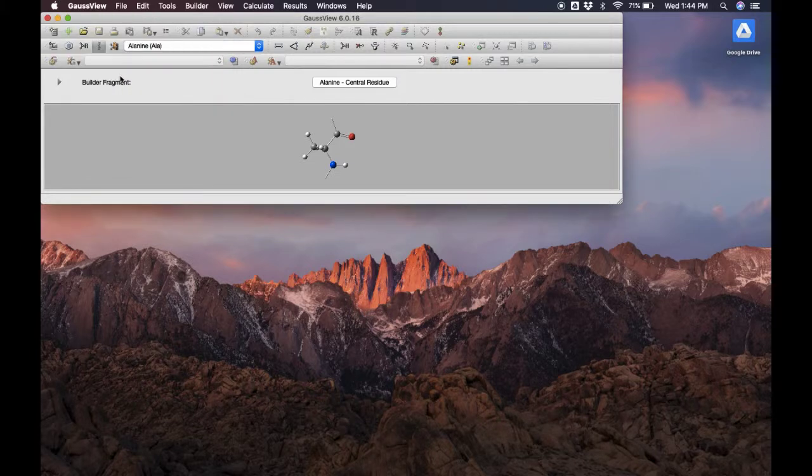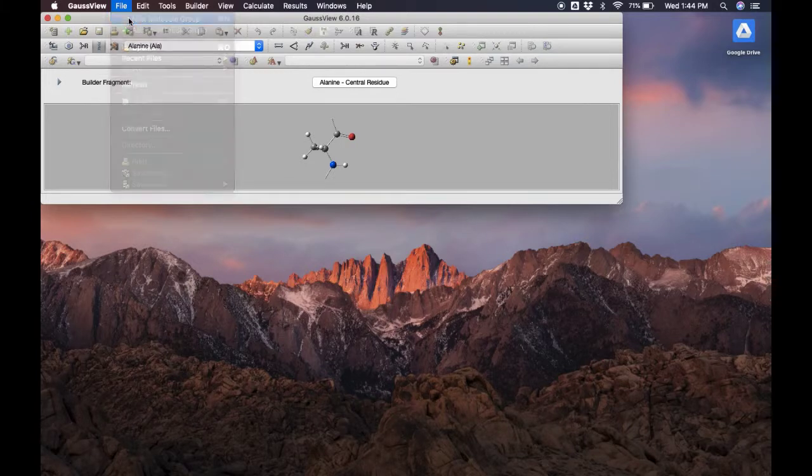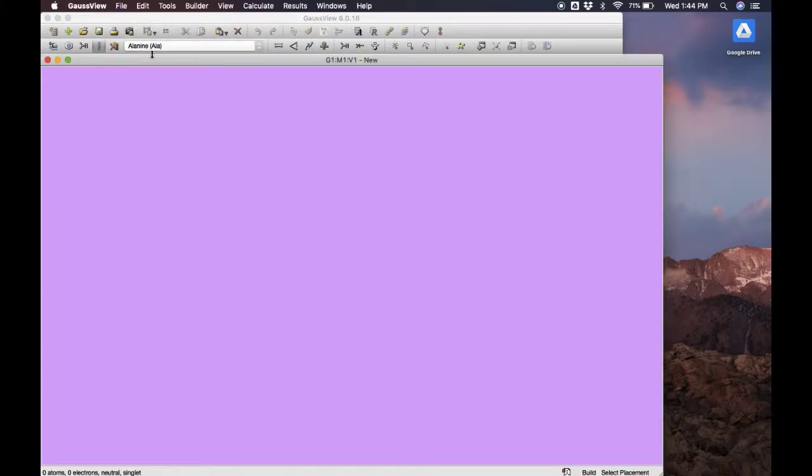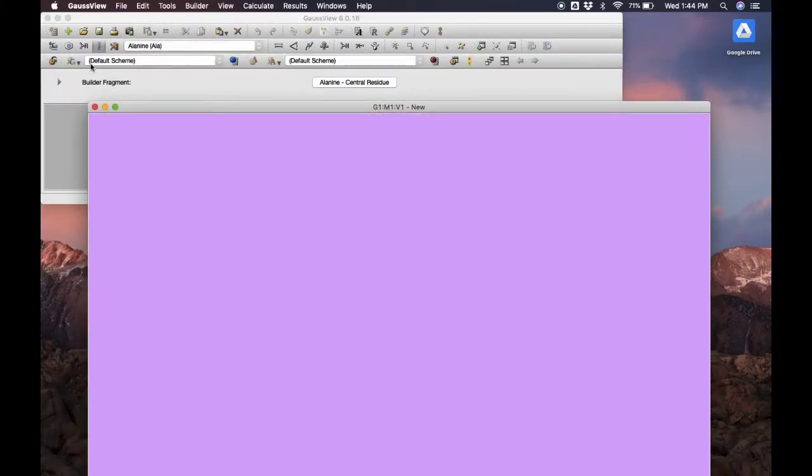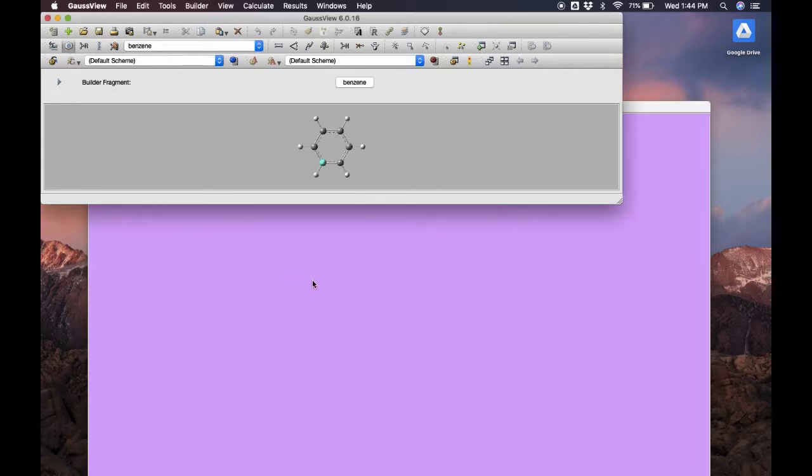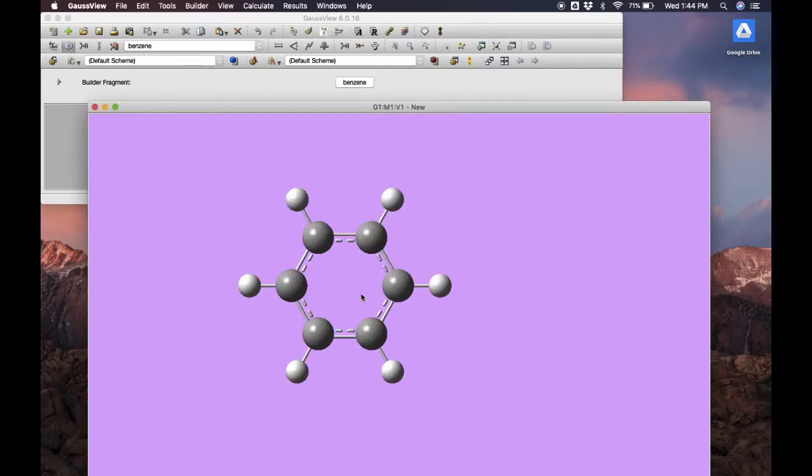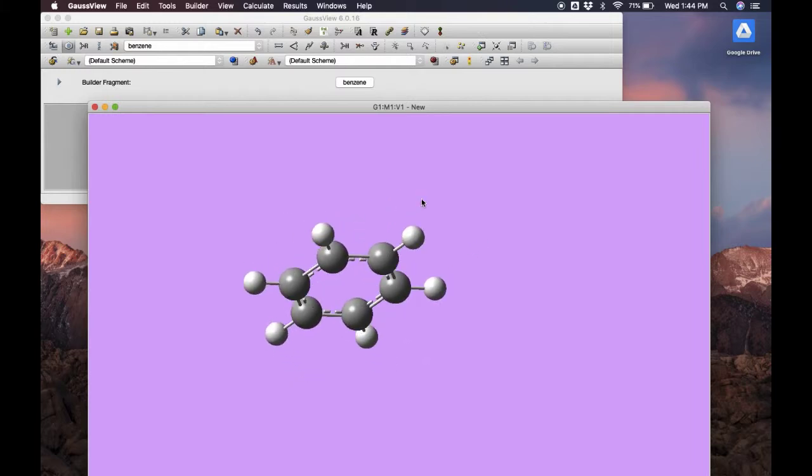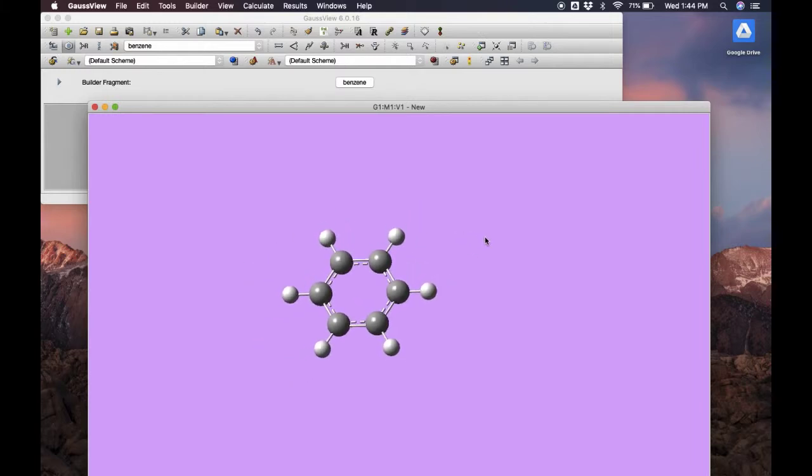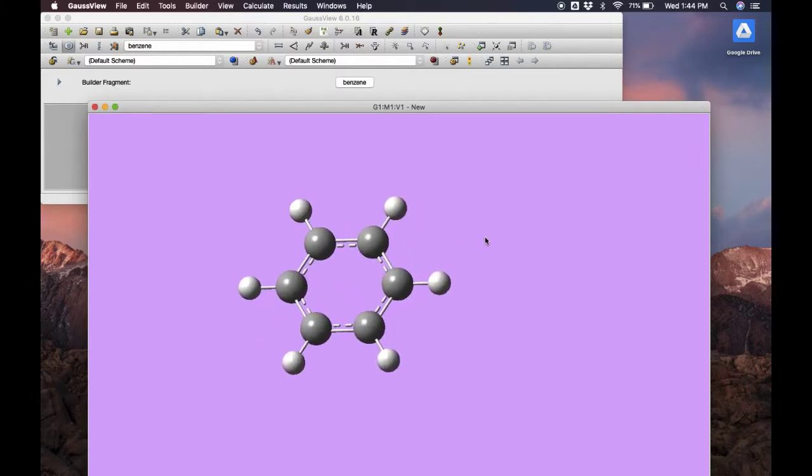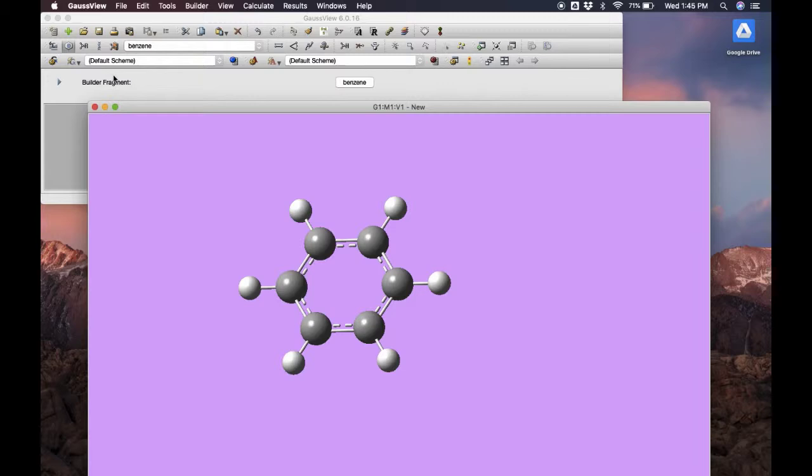Now we can start by selecting to create a new molecule group by going to File, New Molecule Group. This is our molecule viewer here. For this video, I'm going to create dimethyl aniline, which has a benzene ring, so we'll click on benzene and then simply click in the molecular viewer. You can drag around to see it, scroll in and out to zoom.